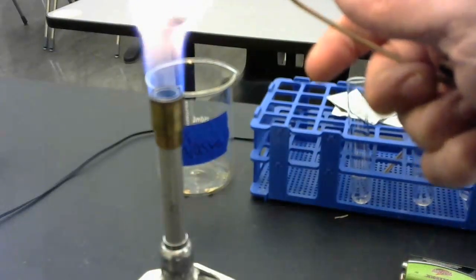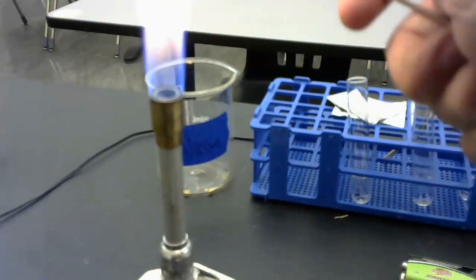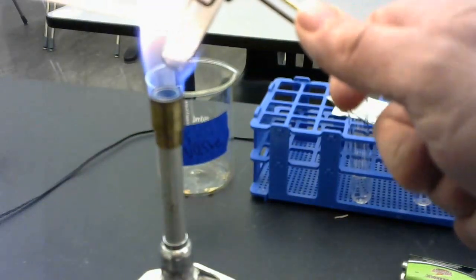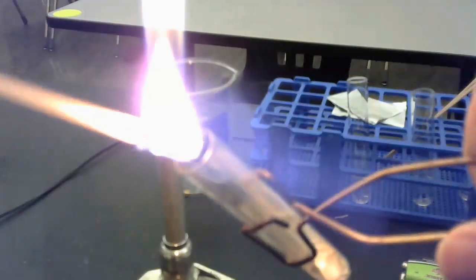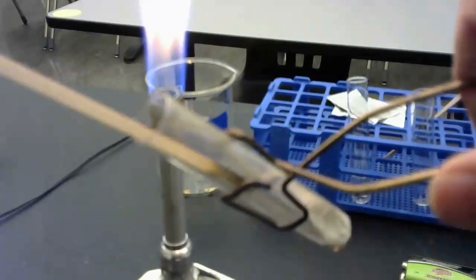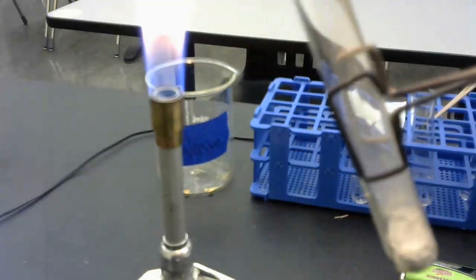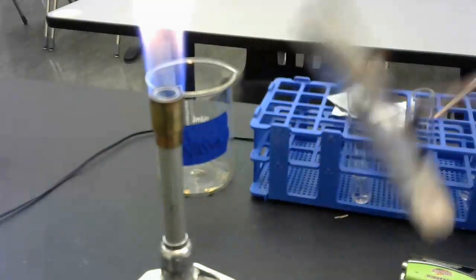And towards the end of my heating, I want to figure out what a wood splint is going to do. So I'm going to take this piece of wood and stick it into my flame so that it's burning. Then I'm going to bring it close to my test tube and bring that down. Hopefully you can see a thicker white smoke was produced. And really what that is, is carbon dioxide affecting the burning wood splint, okay?